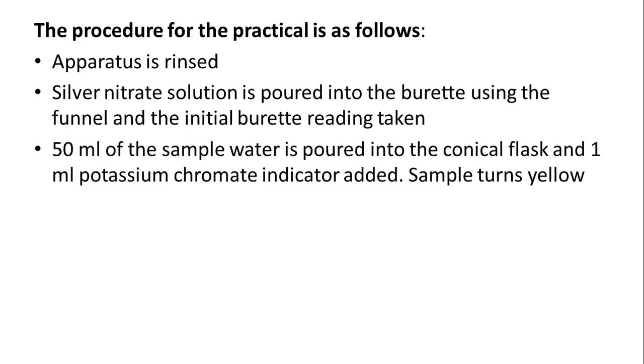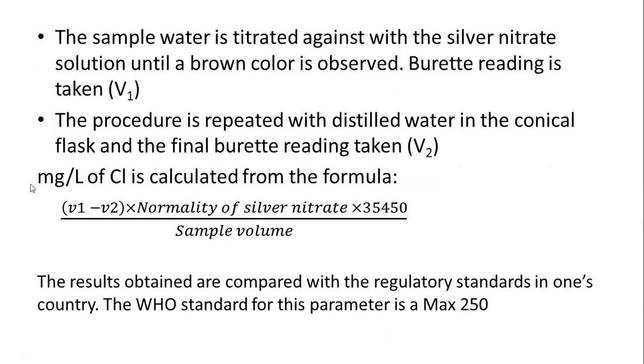You are supposed to repeat the procedure. Now, instead of using the water sample, use distilled water. Just take distilled water, add the indicator, and then you titrate it and then get the final burette reading. And the unit for chlorides is milligram per liter of chloride.